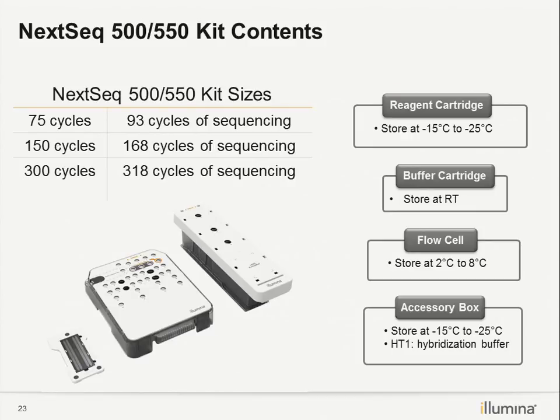And that 2 cycles is included as well. That's why it's 300 plus 8 plus 8, so 2 index reads, and then plus 2 more cycles for phasing pre-phasing. That also means if I'm doing only a single index, you have 8 extra cycles left over, and if you want, you can make use of the 8 cycles. I want 2 times 155. Yeah, you can use that.